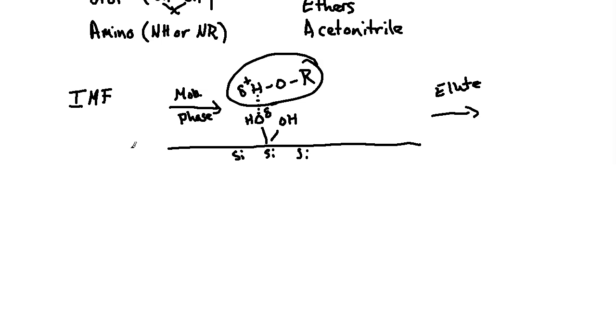But the nonpolar analytes, we would expect them to come off of the column first, and then the more polar analytes, with that localization or adherence, are going to be coming off the column last, as far as retention time is concerned, okay? So when a nonpolar mobile phase is used, it easily moves the other nonpolar analytes off of the column, giving them earlier retention times. And then oftentimes slightly stronger polar solvents may be needed to slowly break apart the localization and usher it along in the process.